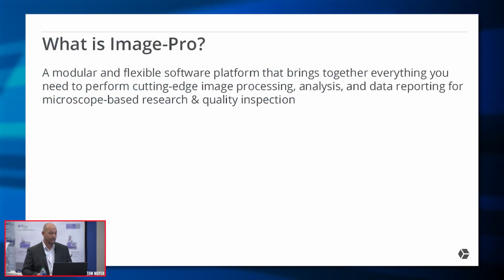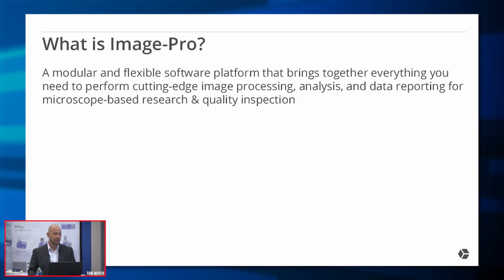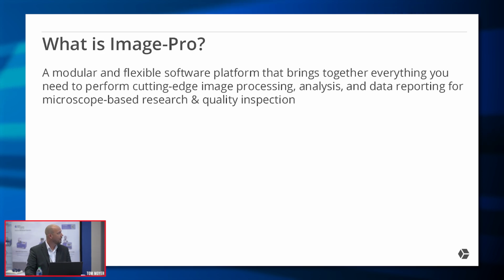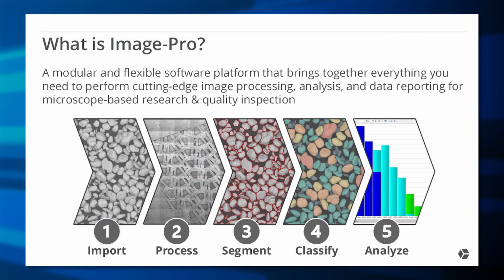We have a modular and flexible software platform that brings together everything that you need to perform cutting-edge image analysis, through processing, the analysis, and then exporting that data. This is for microscope-based research and quality inspection. These steps represent the typical image analysis workflow.